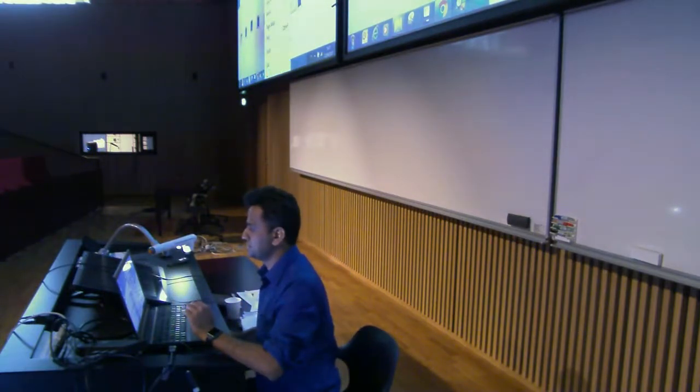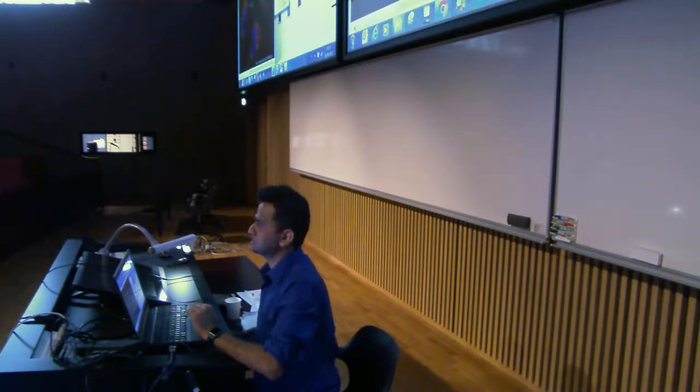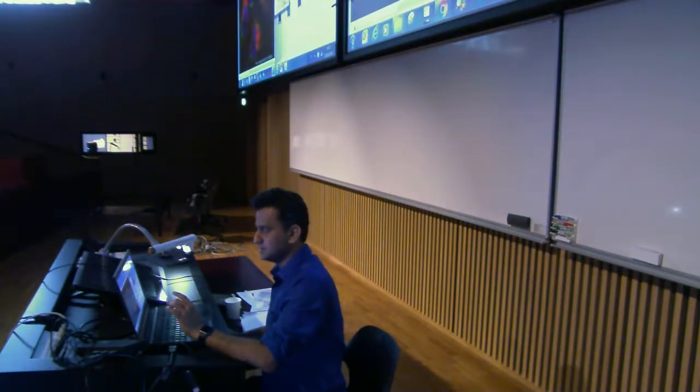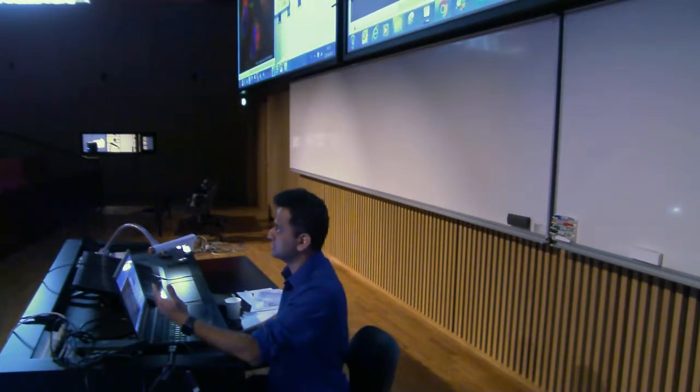Okay. So you just go here, samples again. I keep on actually closing all these things. So yeah. But then the value wouldn't change if you did not push apply. Yes. But it's only visual. So that's why I said you're allowed to do whatever you want to do here. Don't hit apply button, because this is for you, for the user, what he prefers to see and look at, right? That is possible, that you can change whatever you want.